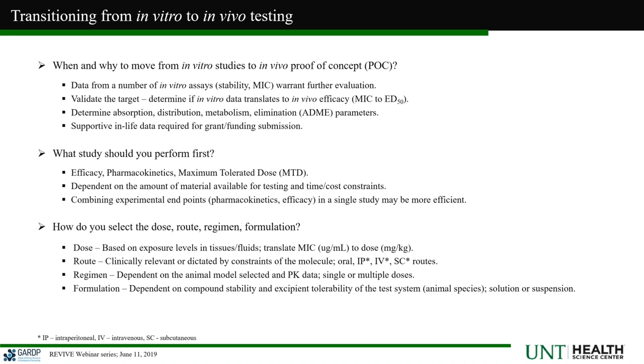The other question that comes up, how do we dose? What route do we dose? What regimen do we use? What's the best formulation? So in terms of dose, route, regimen, and formulation, we'll go through a lot of these in a little bit more detail, but how do you decide what dose to start at? A lot of that can come from the MIC. The MIC is very low, obviously, the dose could be a little bit lower. The MIC is a lot higher, and then we might have to start at a higher dose.